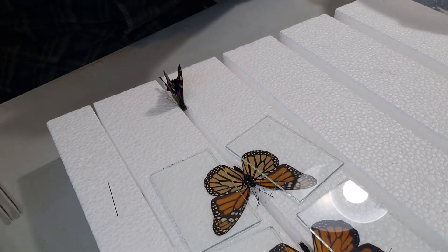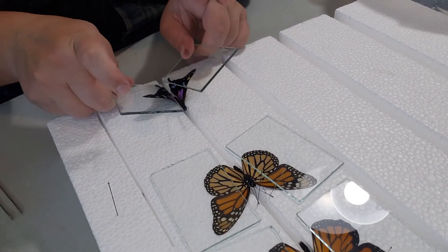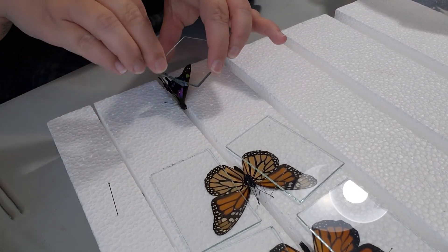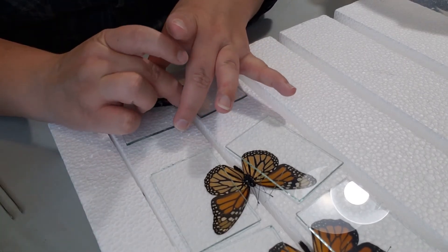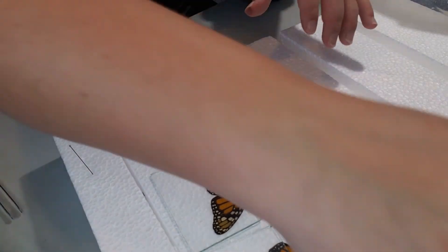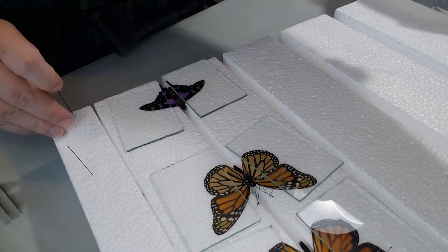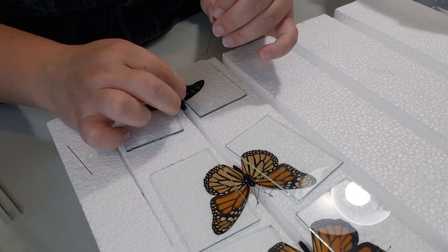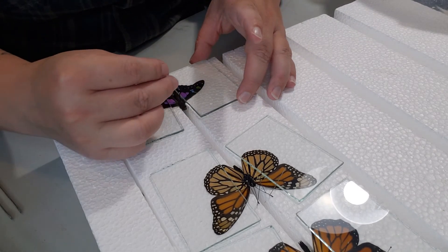Once you have it in your board, go ahead and take your glass slides — or maybe you're doing the parchment paper method, but we'll cover the glass slide method here. Plop those down over the wings and make sure that the wings are not buckling at the shoulder.